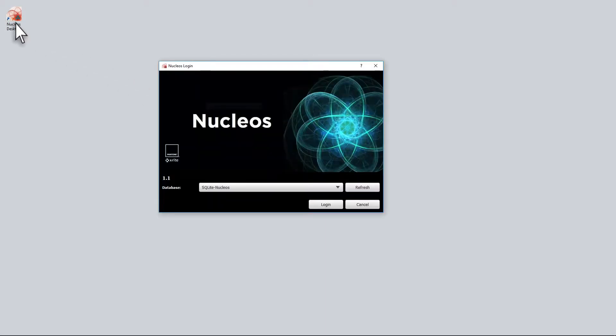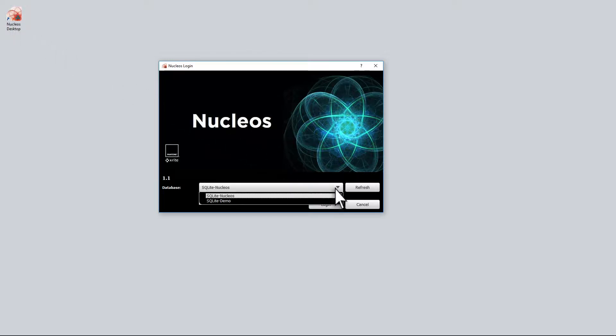When you first start Nucleos, you will be on the login screen. Here you will select the database that you will be working with. These are the default databases the installation created.